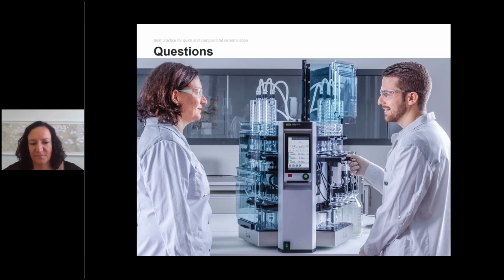So if you use boiling stones, it's really our experience to replace them every time, because the principle of the boiling stones is that there are small pores where the air bubbles, or the vapor bubbles, are generated and the boiling retardation is prevented. And whenever they are used, these pores no longer have the same quality, size, or properties. So we really recommend to use them only once.